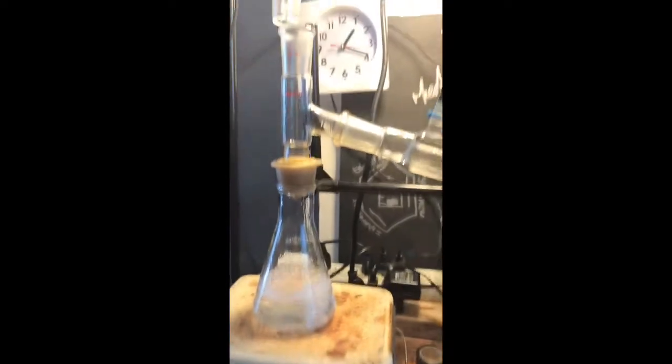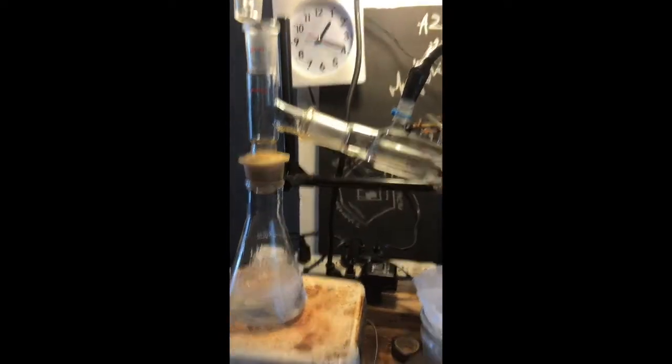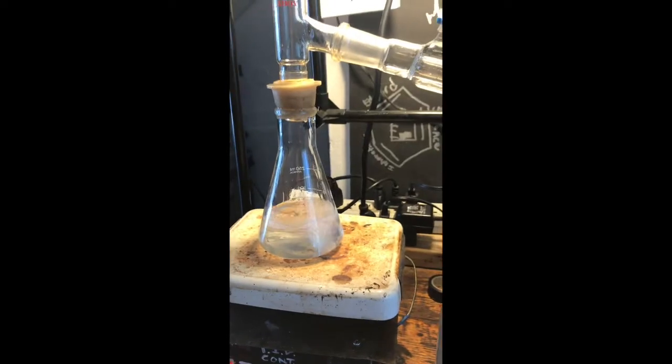So yeah, put your boiling chips or stir bar in the flask before heating them, and if you have to put them in, let the flask cool down before you do that.